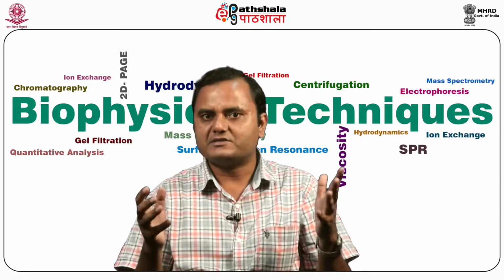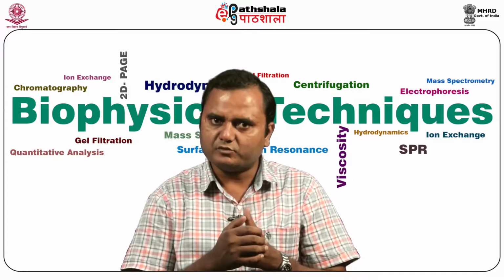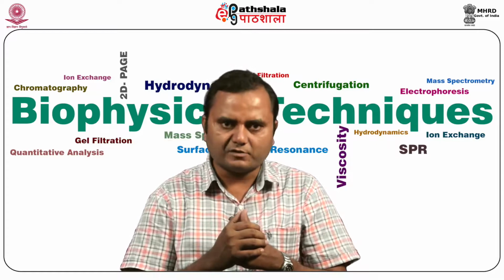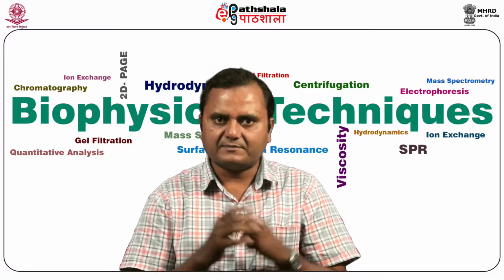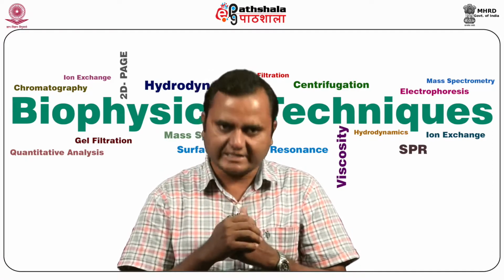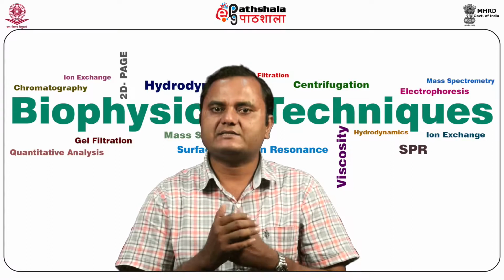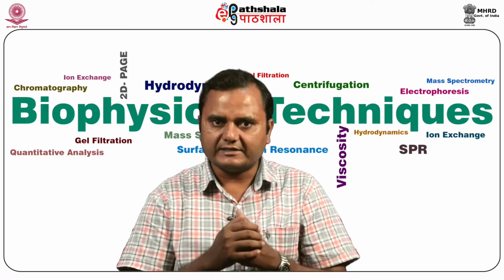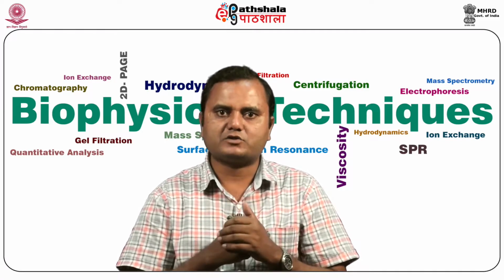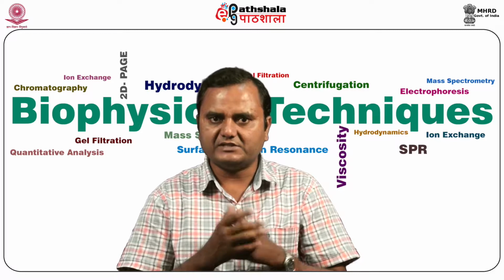But some molecules are devoid of the property to absorb light. In that case the Rayleigh interference optical system is used for measuring sample concentration, based on refractive index changes rather than absorbance. It is used to analyze macromolecules lacking an intense chromophore, for example polysaccharides, and samples that contain a strongly absorbing buffer component such as ATP, GTP, DTT.